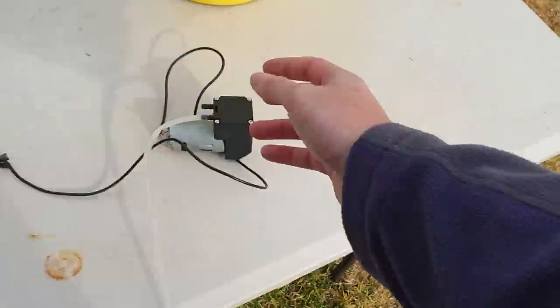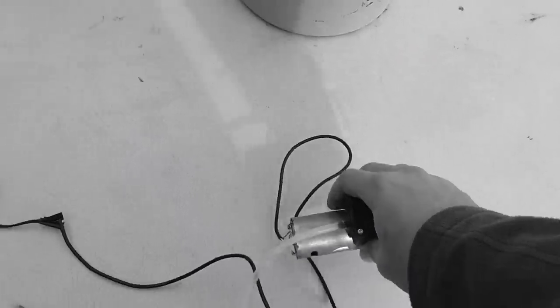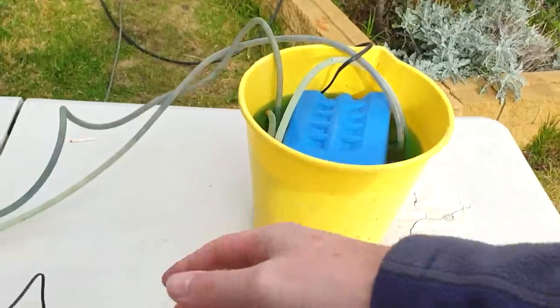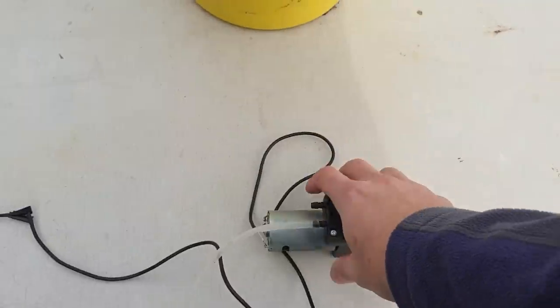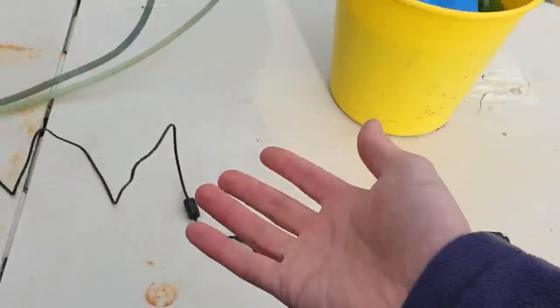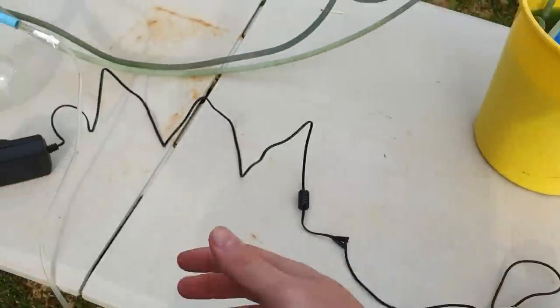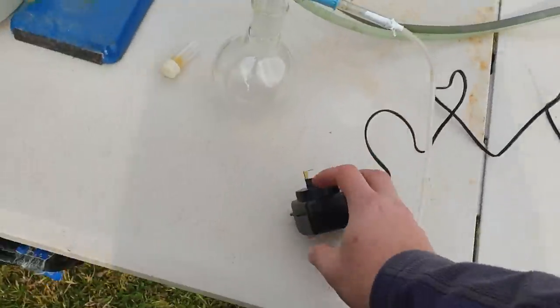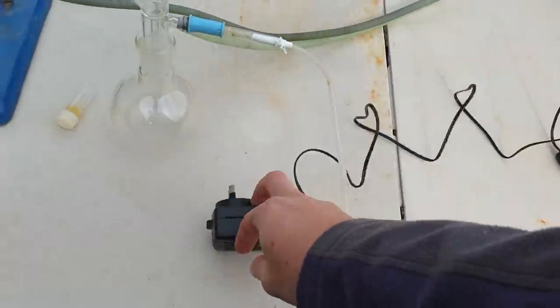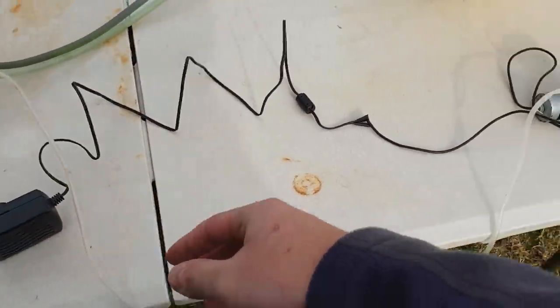This is our shitty vacuum pump. Well, it's not that shitty, but I don't mind if it gets ruined over time because it's not my big, precious, high vacuum pump. So it's just a little eBay 12-volt pump. It's got a brand new power supply. Thank you, everyone, from that video before, that recommended that I need a better power supply, because it was stalling because it wasn't getting enough current. So now I've got a power supply that gives it more current.